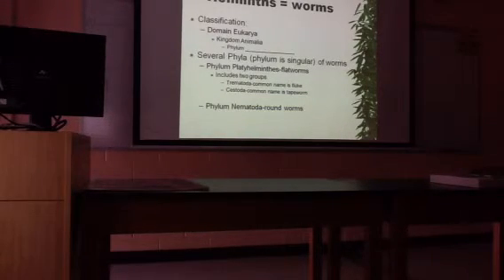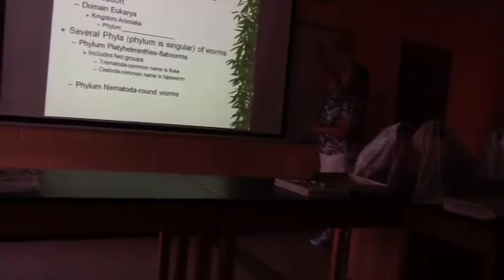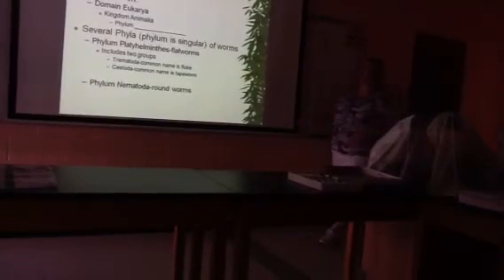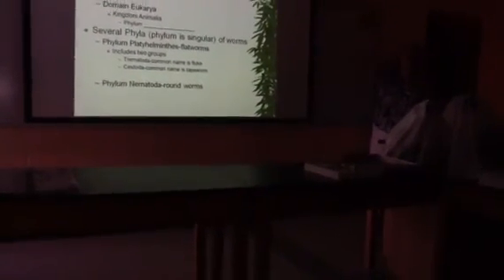One last thing to warn you about, the Trichinella slides, the last 2 on your list. Trichinella lives in muscle. This is really the worm in pork that we're worried about while we can't eat medium rare pork. So what you're going to see on that slide are a bunch of muscle fibers running across the slide. And then the worm itself is going to be coiled up in the muscle fibers. Just so you know what you're looking at. But again, you're never going to have to tell me it's Trichinella. You're going to have to tell me that it's phylum Nematoda. I'm just giving you fair warning that that one's a little bit different than the other slides because it's in muscle.